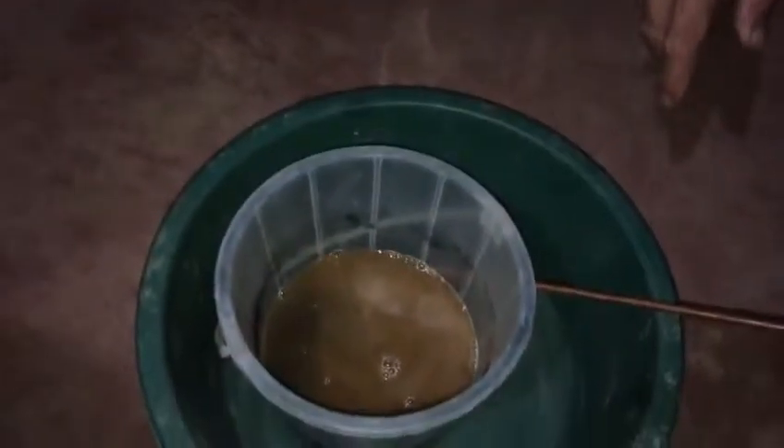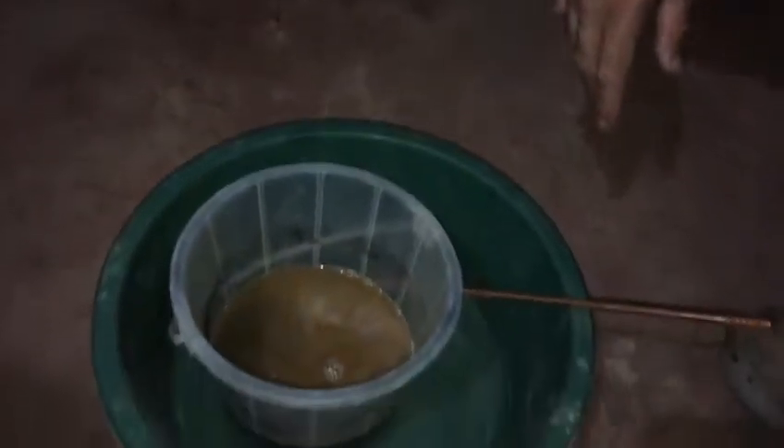We'll wash it on the table again and then we'll have a very small amount to roast. After it's roasted, we'll grind it a little more and it will go to the first part of our leaching process with hydrochloric acid.